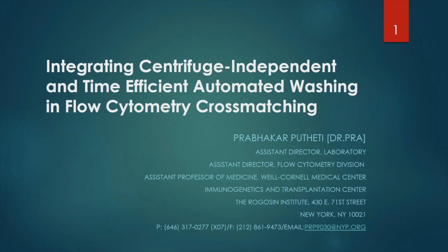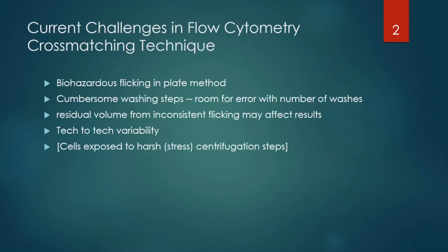The title of my webinar today is Integrating Centrifuge Independent and Time-Efficient Automated Washing in Flow Cytometry Cross-Matching. You would see on the top right the slide number. In case you have any question regarding any particular slide, at the end you can indicate that slide number and I can go back and show that data and describe it or address any questions. There are challenges in the flow cytometry cross-match technique, and the current challenges are as follows.